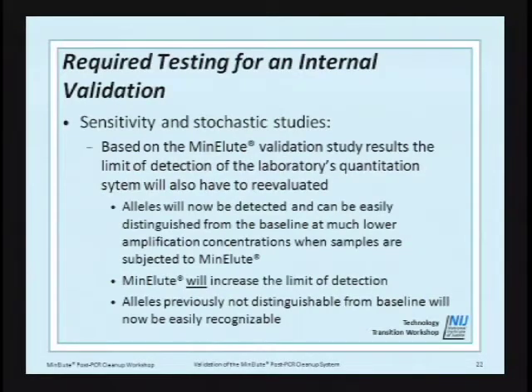Okay, so back now to our study. So now that you've set your limit of quantitation, your actual quantitation level, and you have your quantitation correct, now you can go into your sensitivity study.